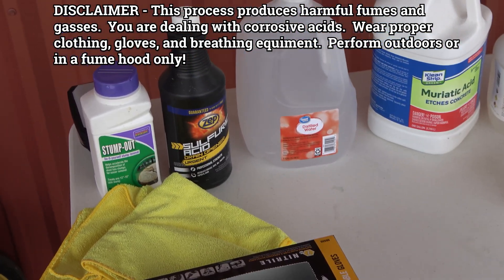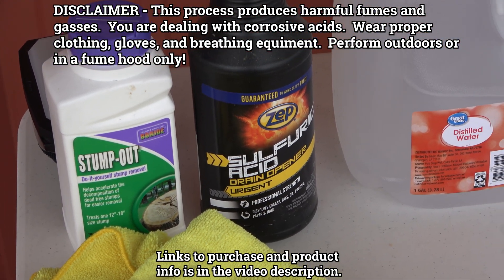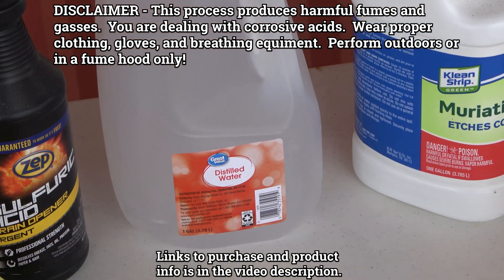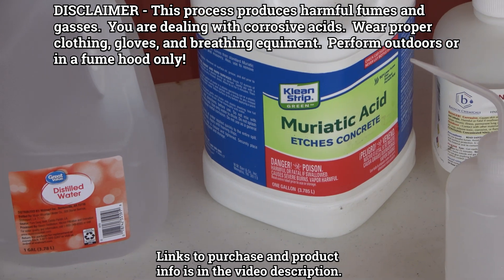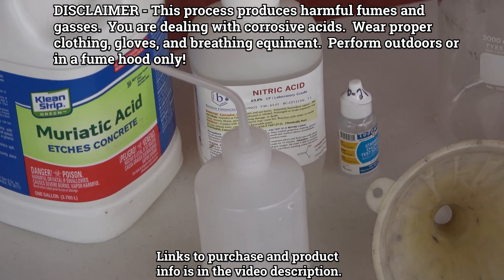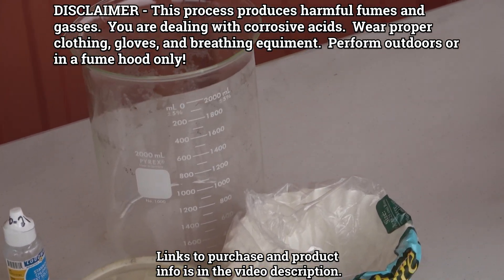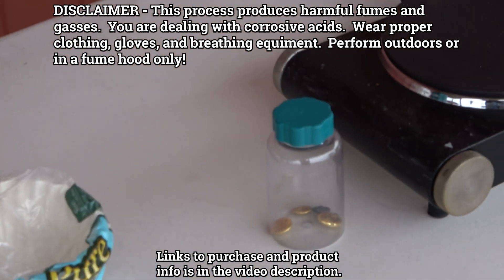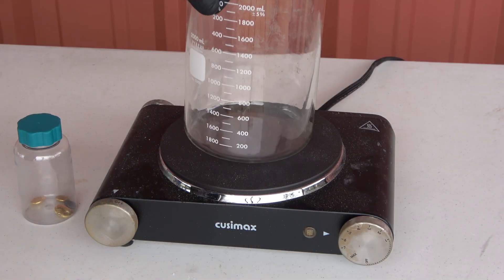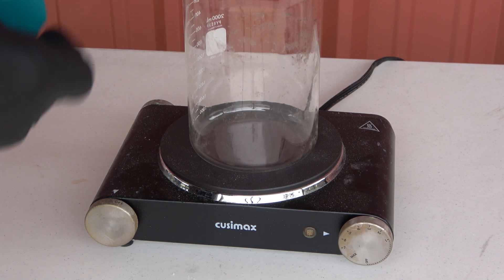Here's what is going to be needed: sodium metabisulfite, which is Bonide Stump Out from Home Depot; sulfuric acid drain cleaner - make sure it's sulfuric acid based; distilled water; hydrochloric acid which is muriatic acid; nitric acid; and some stannous chloride - not necessarily required but if you haven't done this before, definitely get it. You also need some coffee filters and a heat source.